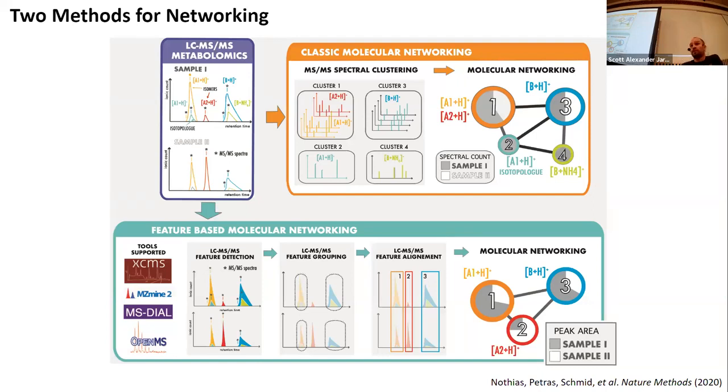If you have a very simple question, right? Often in natural product research we do not have complicated treatment groups, and we don't need to figure out 5% differences in metabolite levels, right? Then maybe classic molecular networking is good enough. And to me, as a general check of my data, when it comes from the machine and I just want to see, okay, does that look good? Do I ID anything out of it?